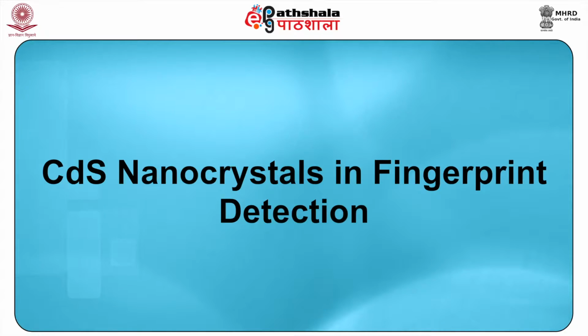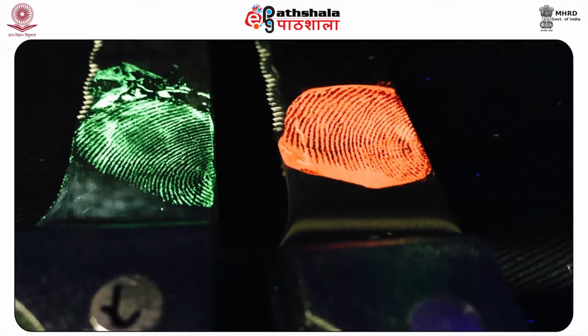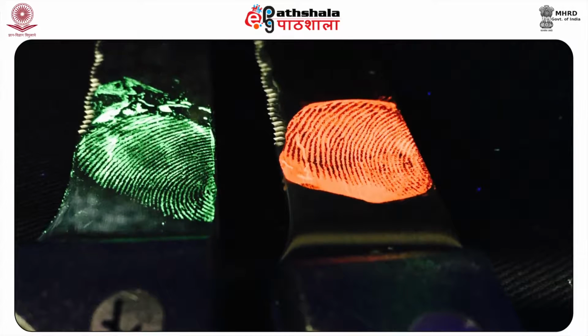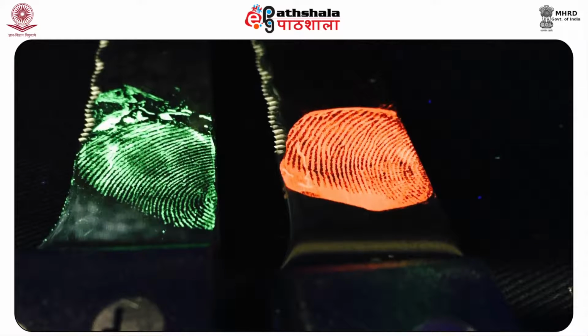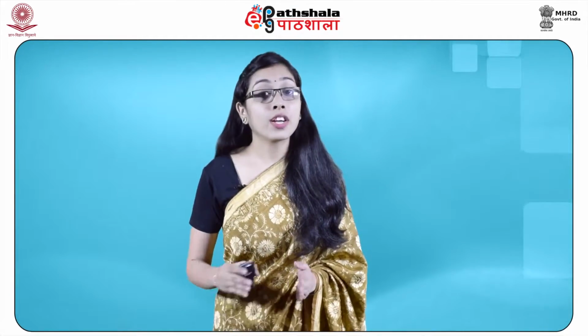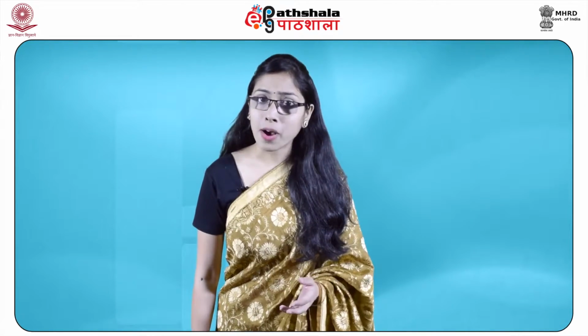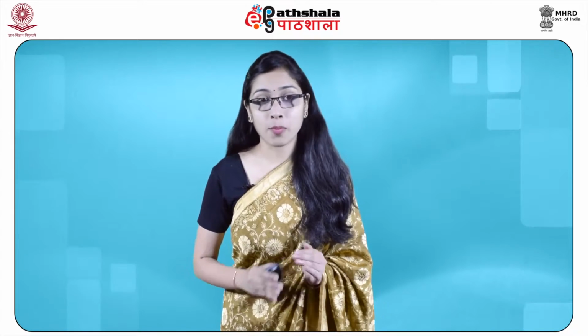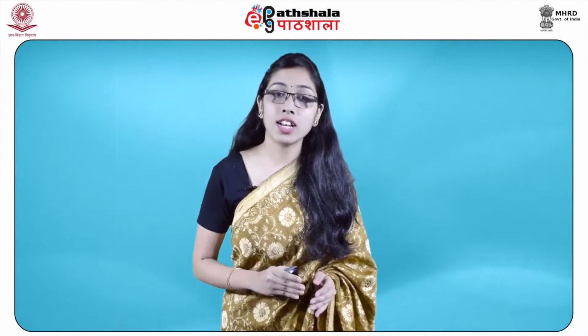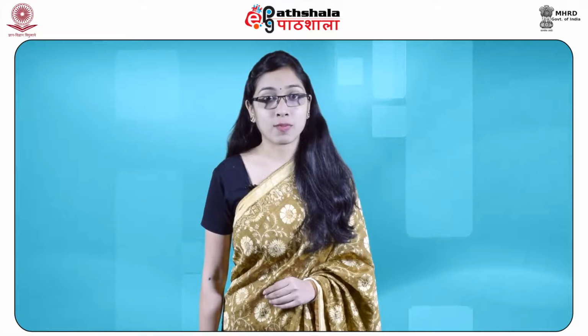Now, we will study the cadmium sulfide nanocrystals in fingerprint detection. Photoluminescent semiconductor nanocrystals may be expected to be used for fingerprint detection in various ways, namely by incorporation into the dusting powder in a manner akin to fluorescent dyes, by blending with the magnetic powders, by staining, especially once the fingerprints have been exposed to the cyanoacrylate ester or cyanoacrylate fuming technique, or by chemically bonding to the constituents of the fingerprint residues. In photoluminescence detection of the fingerprint, the staining approach generally tends to be more effective when applicable to the article under examination than the dusting procedure.